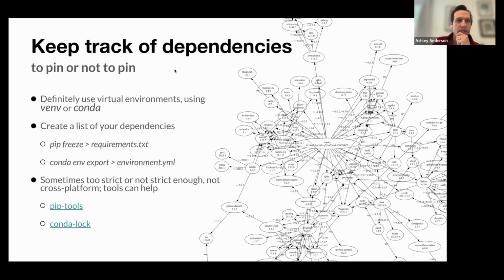So you're going to need to keep track of your dependencies. This is a graph of the dependencies for Napari. And the takeaway here is just that it gets pretty complicated. And so you want to manage these in a way that is reasonable for what you're trying to accomplish.